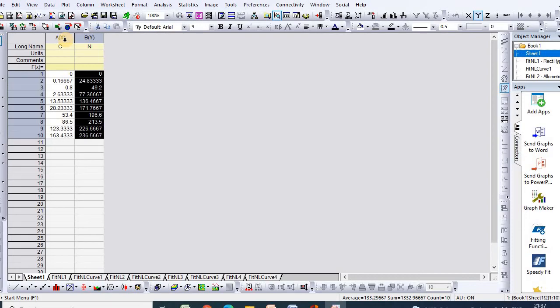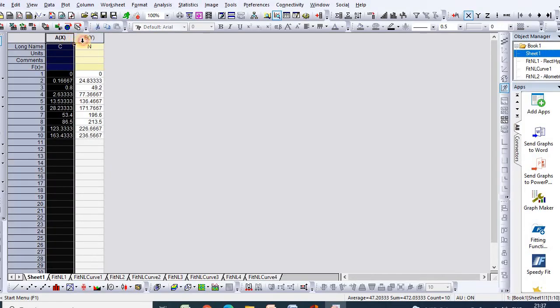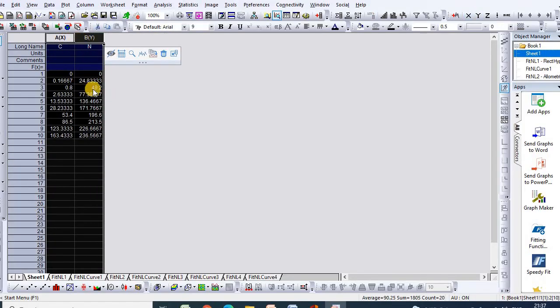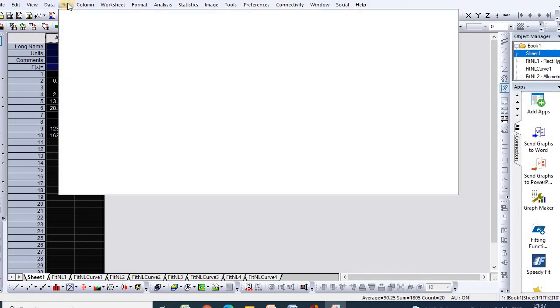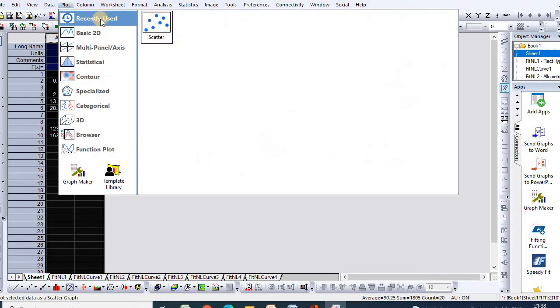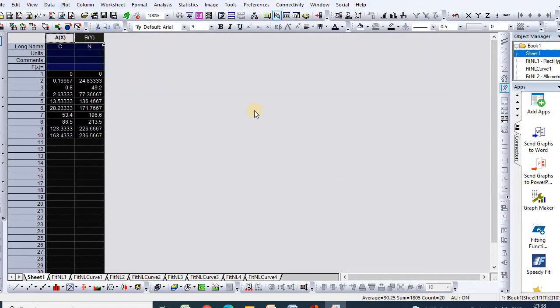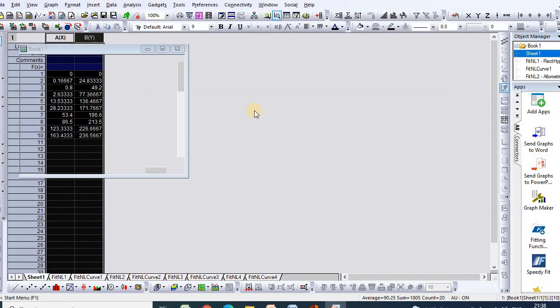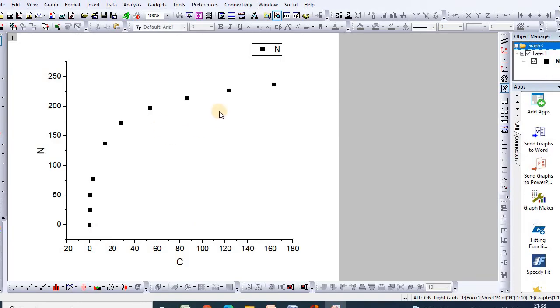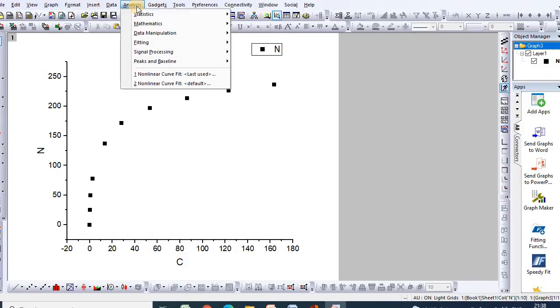In order to fit the Langmuir and Freundlich equations, you need to put your data onto the Origin sheet. Then click Plot and select Scatter Plot — a scatter plot is preferable. Here is your plot. I would like to analyze this plot using the Langmuir equation and the Freundlich equation.